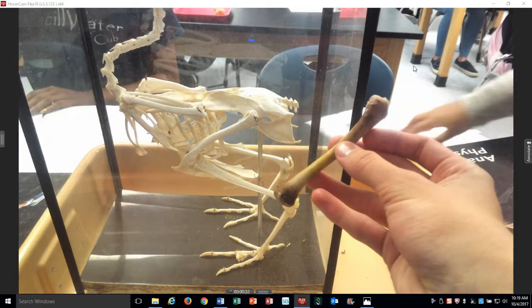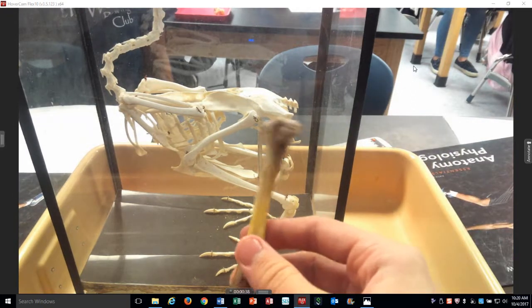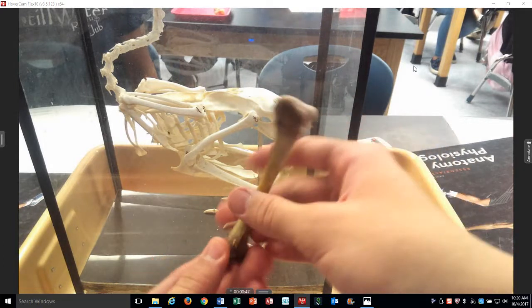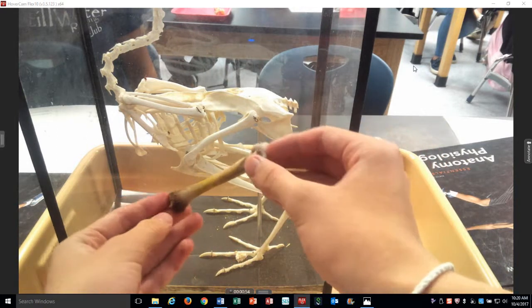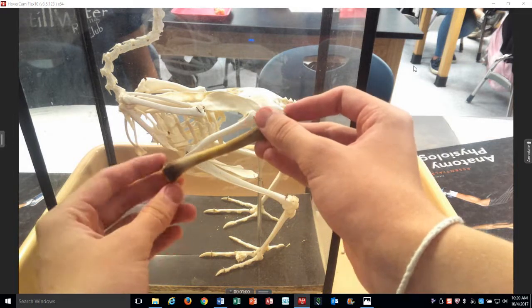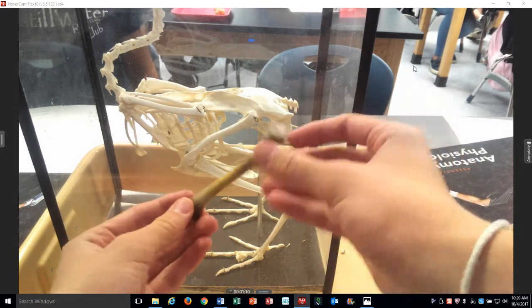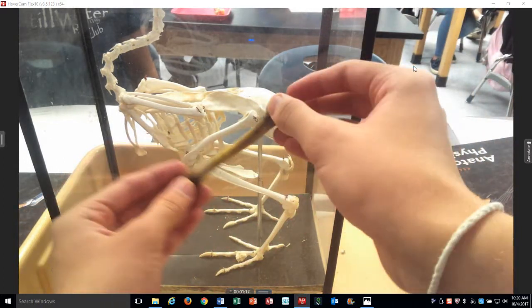He's going to explain where this actual drumstick is from on the skeleton. This bone is basically this top part right here — this top bone that you can see. This is the proximal part of the bone and this is the distal part, because the bigger part is usually the proximal part. I angled it up to figure out which side was anterior and which was posterior. The side with the groove is posterior and the side without the groove is anterior, because the joint is connected to the groove, which allows the bone to move.